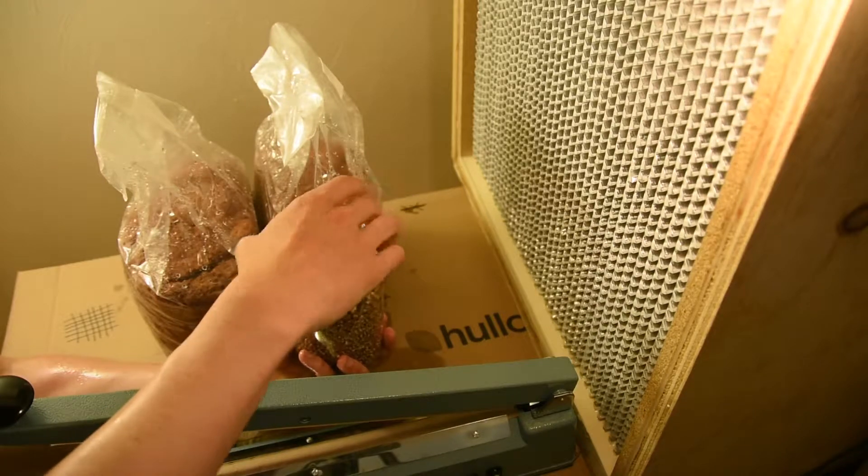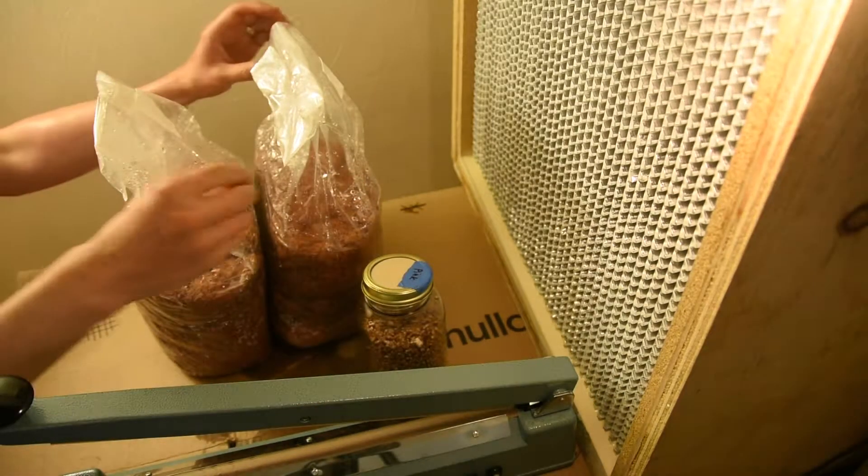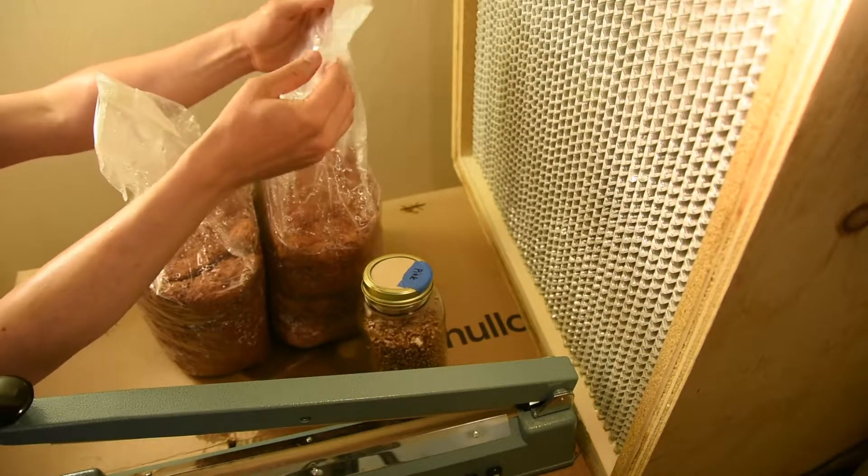I'm loosening the lid so that I'm not going to be fumbling once the project has really started. I'm not taking the lid off, I'm just loosening it. At this point, I'm starting.